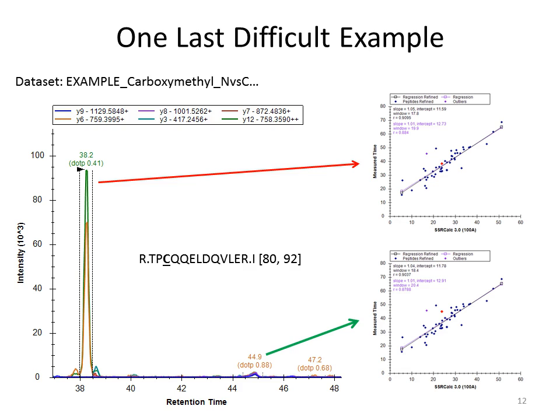This has a carboxymethylcysteine, so it was alkylated with iodoacetic acid. And so that made a modification to this cysteine, which kind of messes up the prediction, which is probably one of the reasons why it's not adhering close to the retention time line. And so these are things that, when you're looking at data and you think it through, it makes sense. But quickly taking a snap judgment of biggest peak, closest to line, no, it doesn't always work that way.